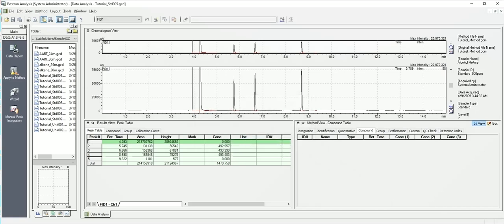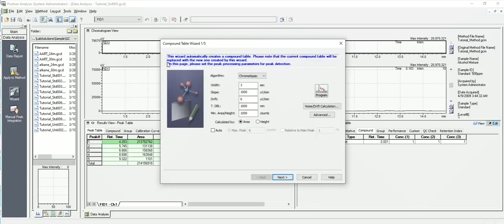So now what I typically would do, this is our first run here, is use our wizard. Click on the wizard. Okay, so here we want everything calculated by area. Here's the slope, peak width, need should be small.